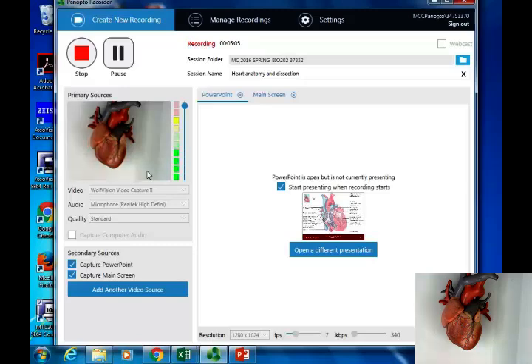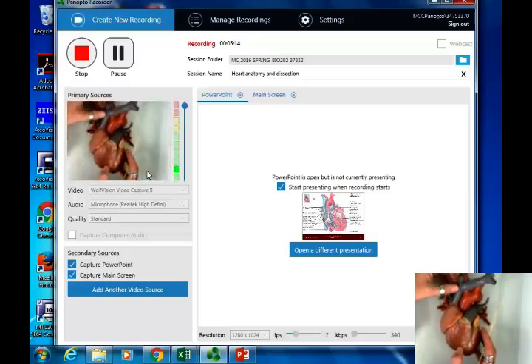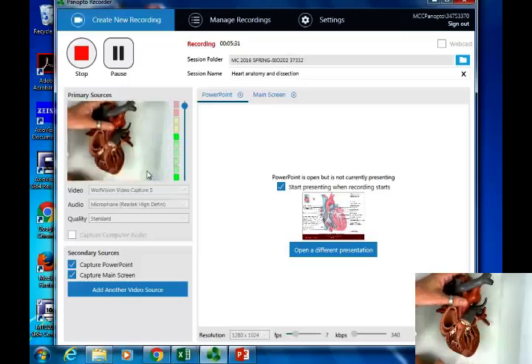All right, so with that heart that we see here, we're going to be looking at the same things. Now the weird thing about this is it's actually a little bit upside down, so that's why I have to be on this side. We're going to be identifying the different main vessels. You're going to identify the individual blood vessels, again, like the right coronary artery that we see here between the right atrium and the right ventricle, and the different branches of the left. You're going to be looking on the inside. You're going to be identifying the different chambers. You're going to identify the different valves.